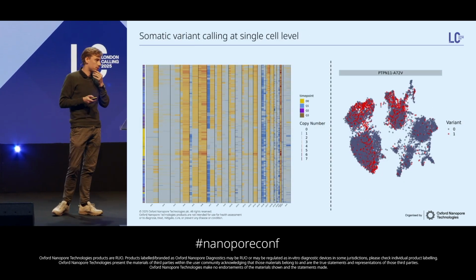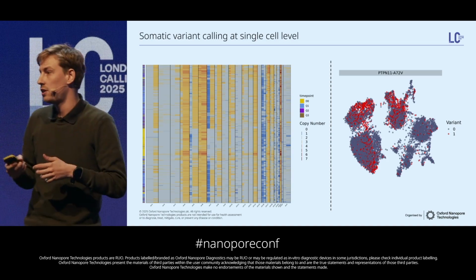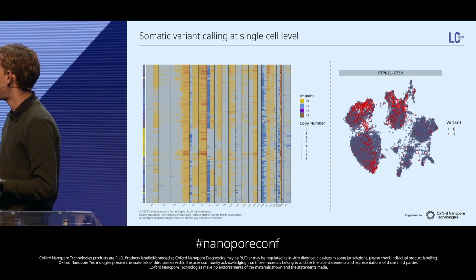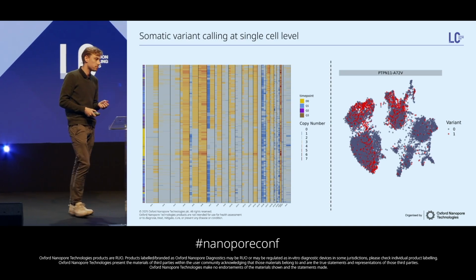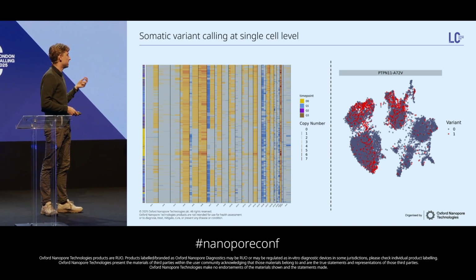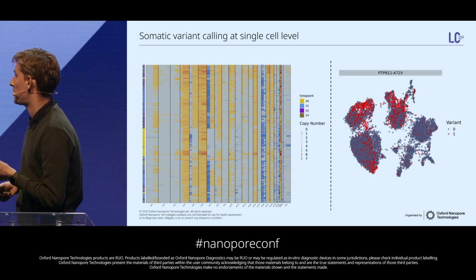And then I'd like to take a step back and actually call mutations at a new genome layer. The sparsity of a single cell makes it already accessible to call copy number variations. On the left plot, every row represents a single cell, and it's annotated with the left vertical bar according to their time point. You can see the copy number genome-wide. When it's diploid, it's gray. Gains are represented in yellow, and when there is a loss, you can see blue.